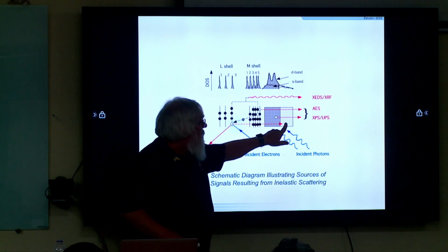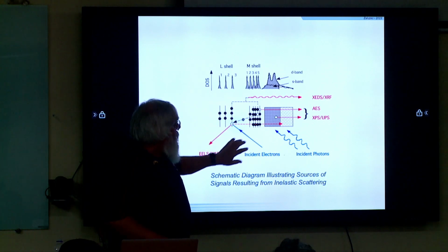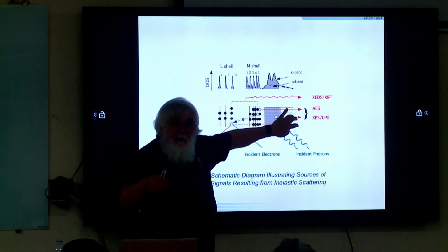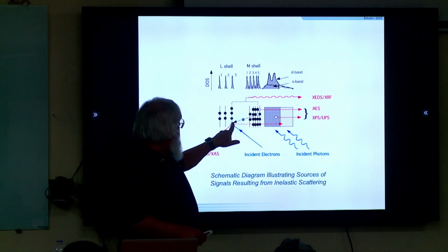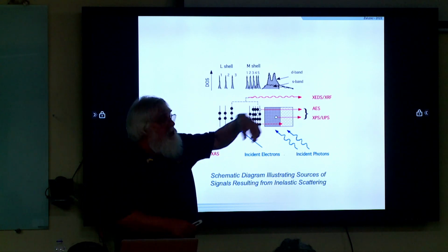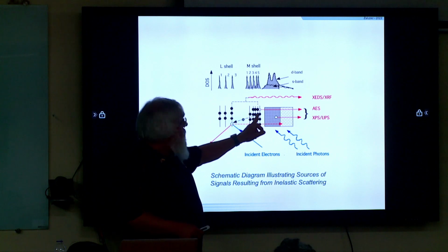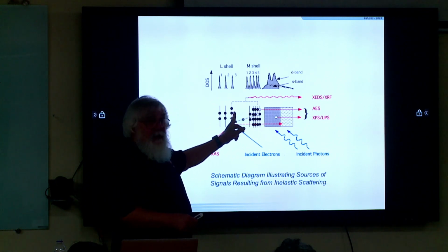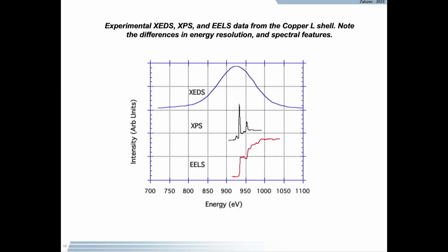And usually it'll knock it above the Fermi level. So this electron will probe information above the Fermi level. When we get an X-ray emission photon, what's happened is that electron's now jumped out and another electron drops down. What we're going to get there is information about the distribution of electrons from that state to that state. You could see that in the shape of the spectrum.